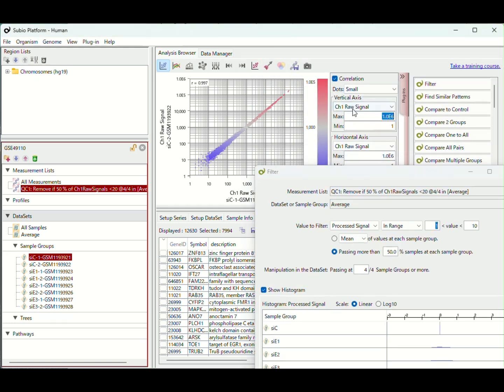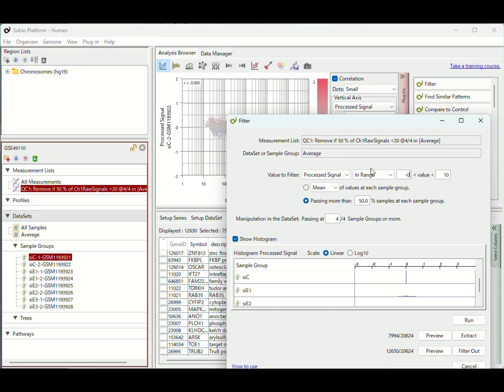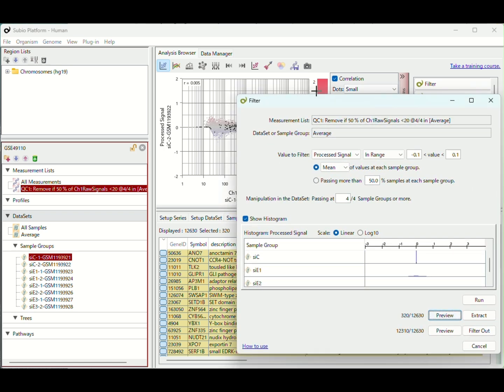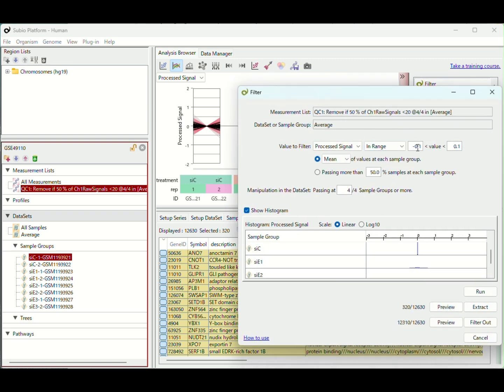The next genes to exclude are those that show almost no expression change. This filtering is not essential for DEG analysis, but it is essential for clustering. Again, we decide the threshold while checking the data in the scatter plot.